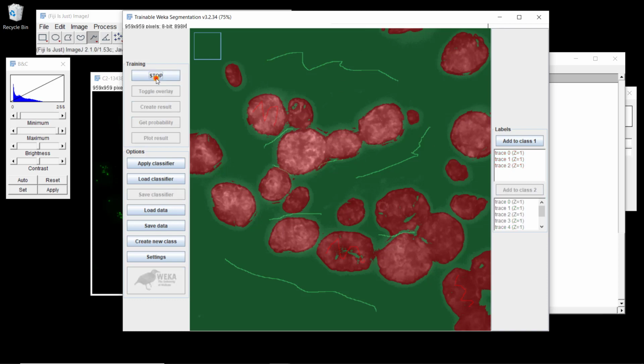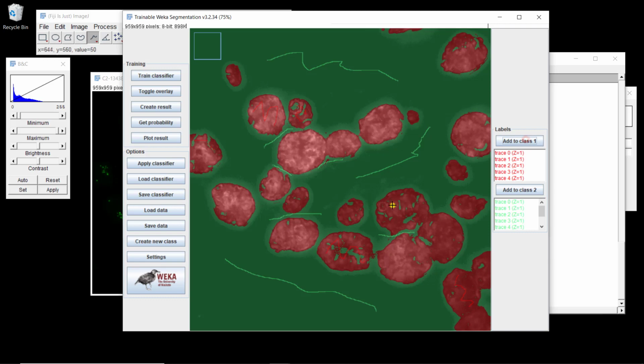The thing is that we might get partial nuclei. Again, we can use mathematical morphology, so that's not automatically a problem. Here it might be too drastic, especially where we have those kinds of dents into the nuclei. So let's add some and see if it can help. Here it's maybe in between, but let's try. We can classify, so train again.